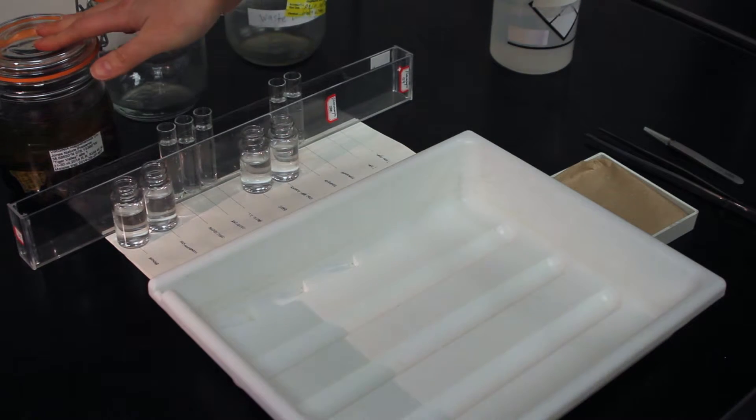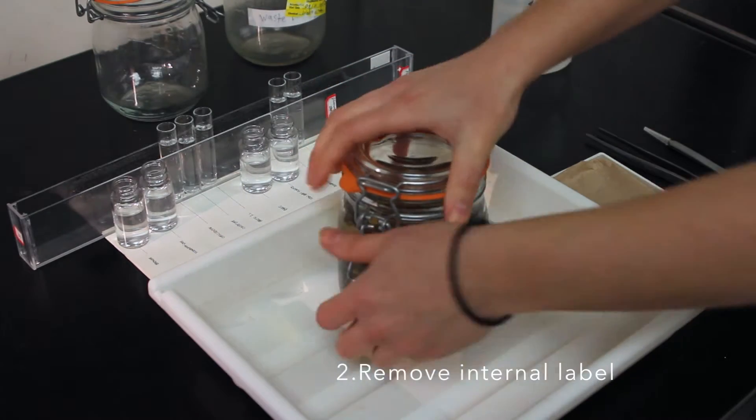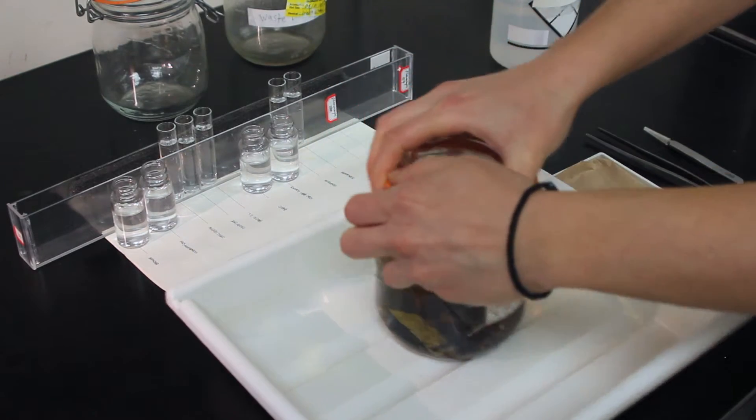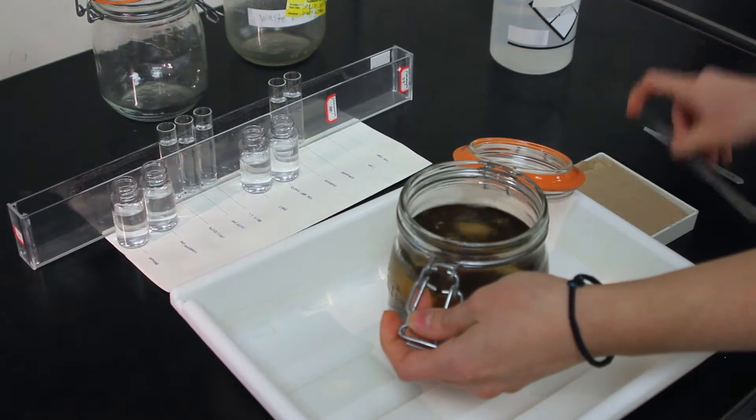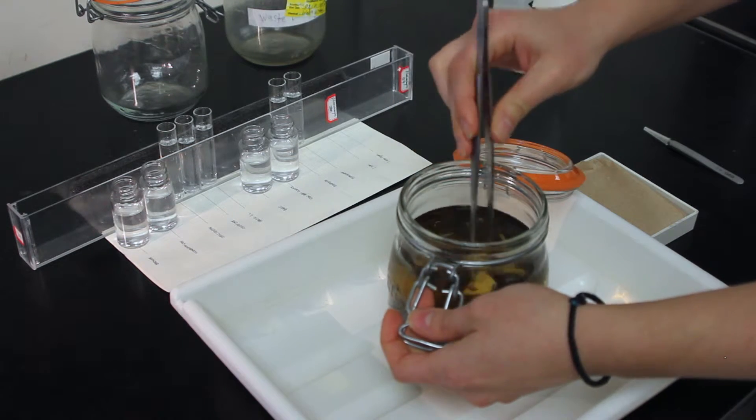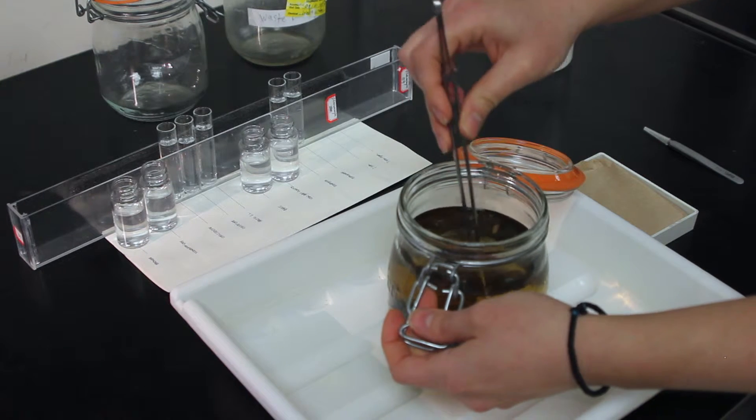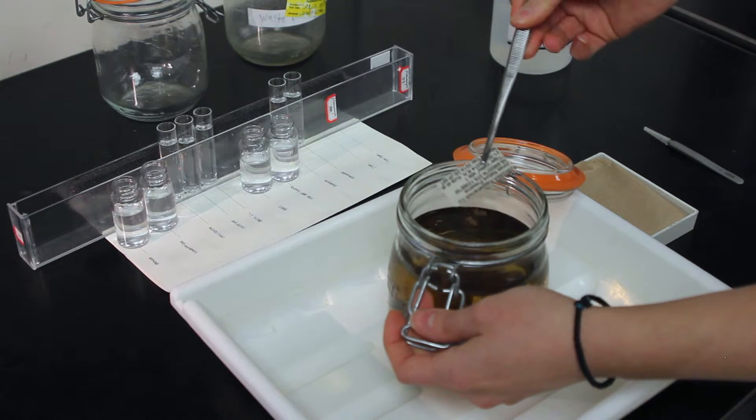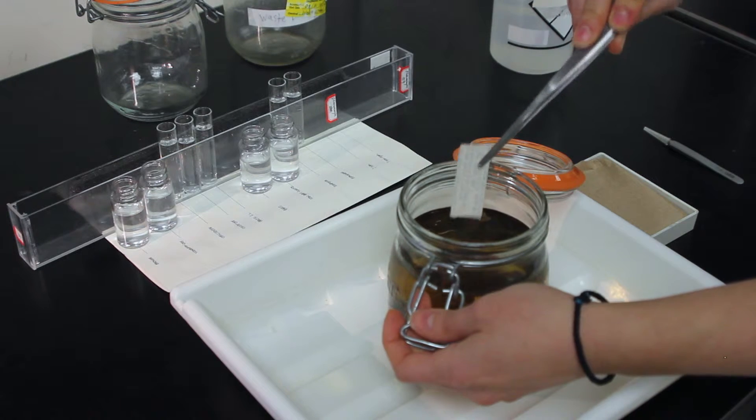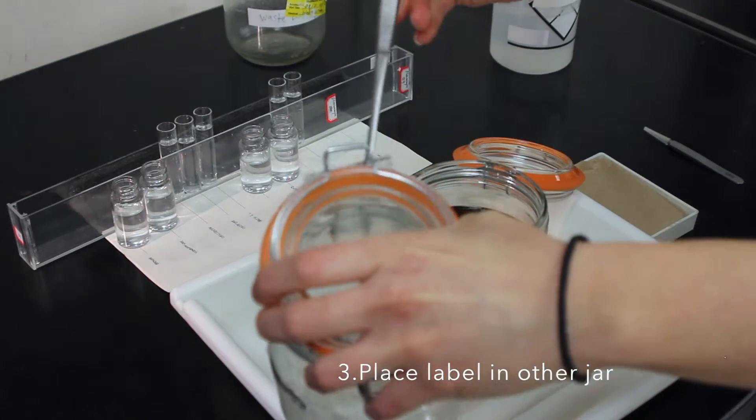From your sample container, you'll need to remove the internal sample label using your large forceps. And we have to be careful to make sure that the label does not contain any organisms sticking to it. We're going to place it in our clean bale top jar.